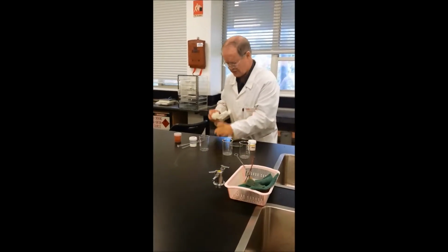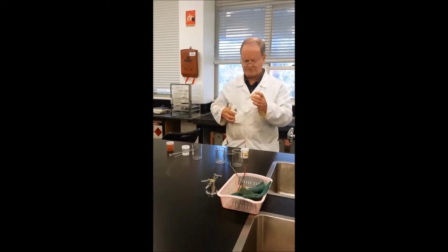We give these a bit of a wipe over and a bit of a dry off.